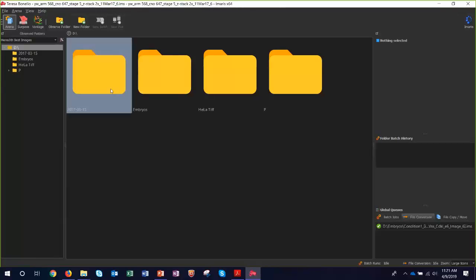Okay, some other things that you may have noticed when I right-clicked was that you can do the copy and the paste. You can rename folders and do that sort of thing. So you do have that sitting there within the arena view.